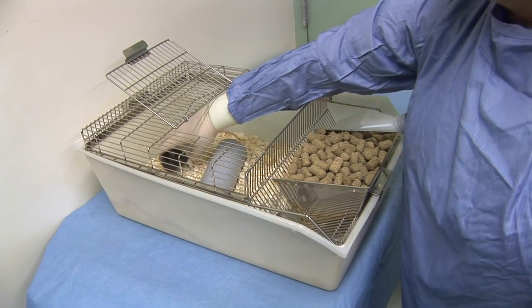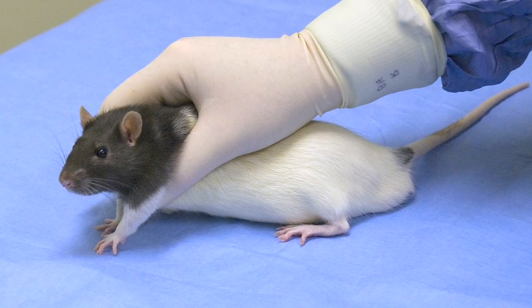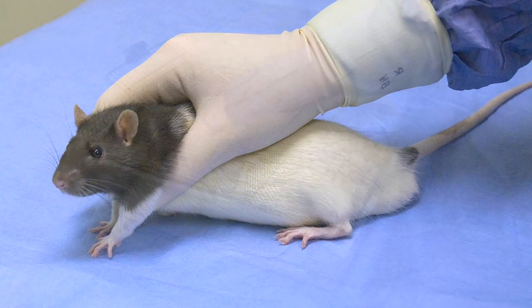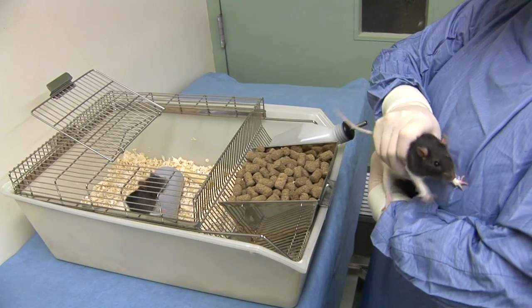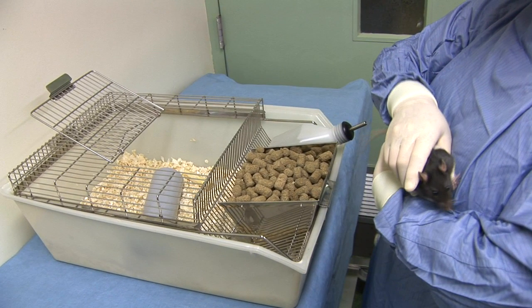The first rat to be injected should then be restrained smoothly without hesitation by grasping it around its shoulders. The rat should then be lifted from the floor of its cage onto your arm or onto the cage lid.